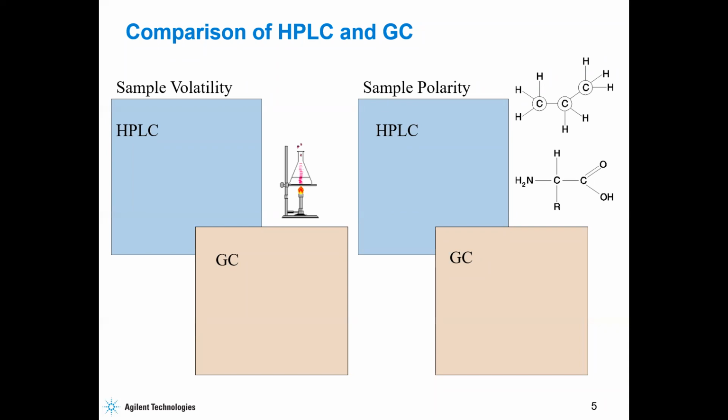You can't compare. The basis of comparison will be that you have used the same flow rate, or you have used the same gradient elution. You can only compare similar optimization. You can't compare, for example, a 30-centimeter column with acetonitrile as mobile phase, and tomorrow you use a 10-centimeter column and use methanol and water. The results will not be comparable. You can only compare when you use the same and identical conditions in your instrument.